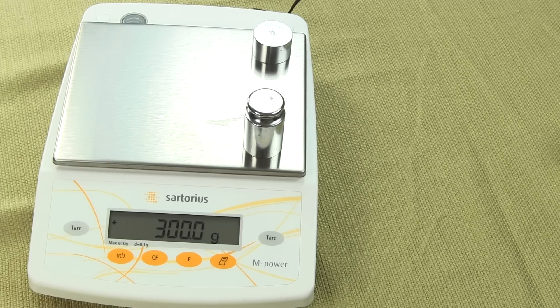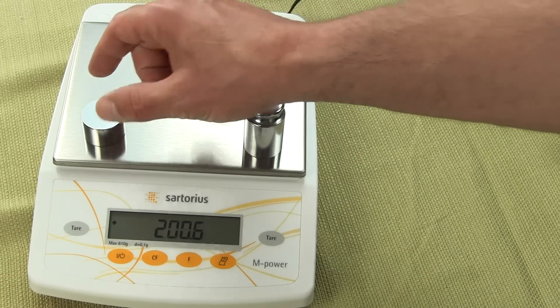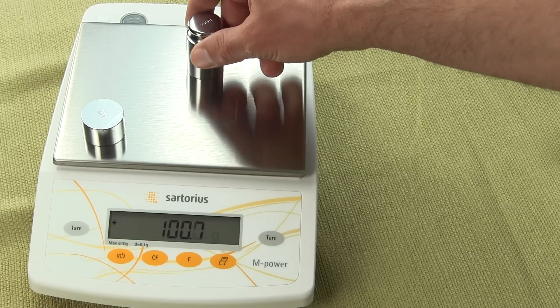Sartorius does offer an external rechargeable battery pack — part number YRB08Z — but it is very expensive and basically is a glorified UPS, uninterrupted power supply. All models in the AZ series, calibration weights are optional. And Sartorius does back the AZ balances with a three-year limited manufacturer's warranty.